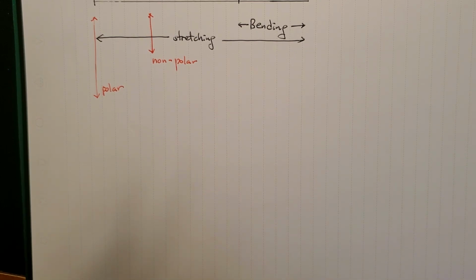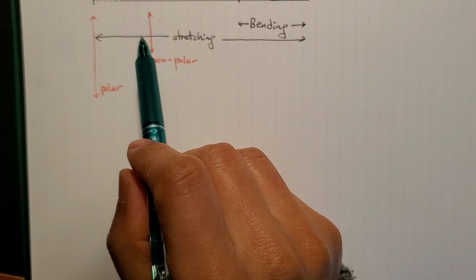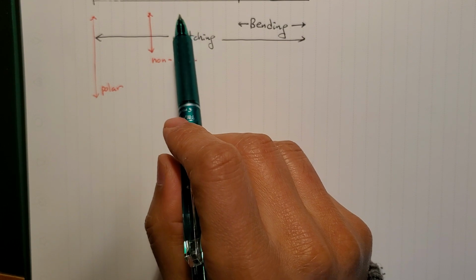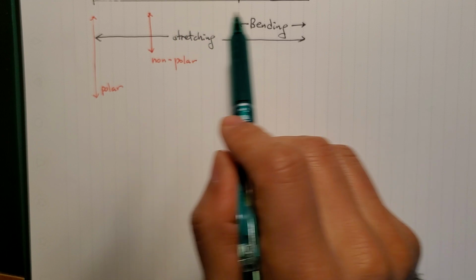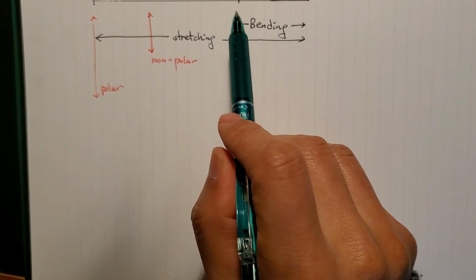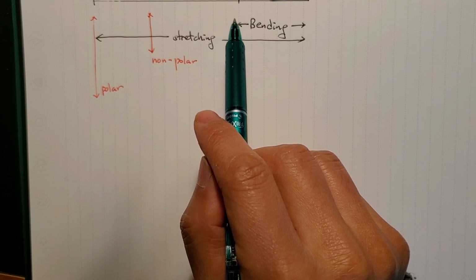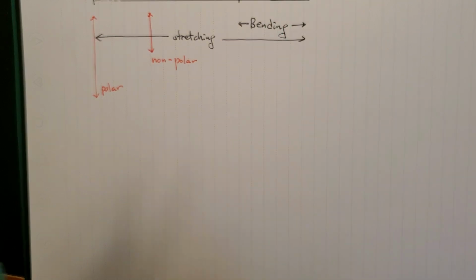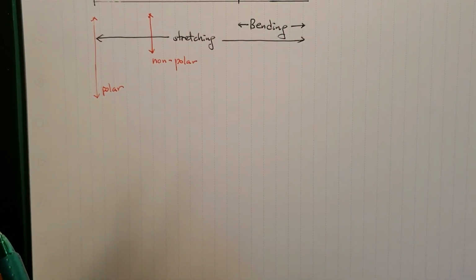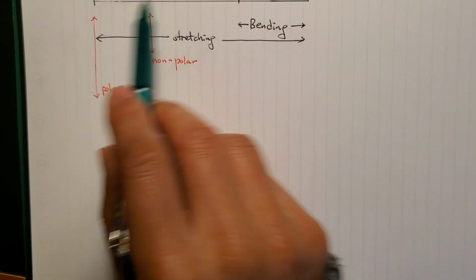And the CH stretchings are coming around 3000, then triple bond around 2200, then double bond of carbon come around 1600 to 1400, and single bonds are falling into this area with a small or medium size. They can be easily confused by bending in this area, but even other area.